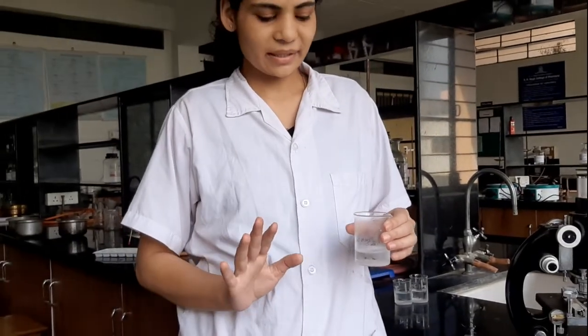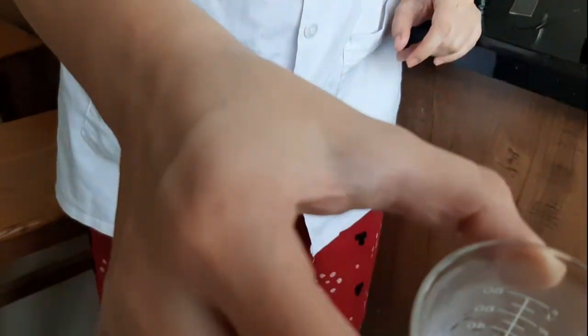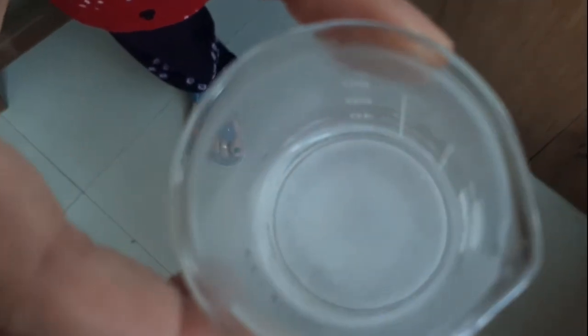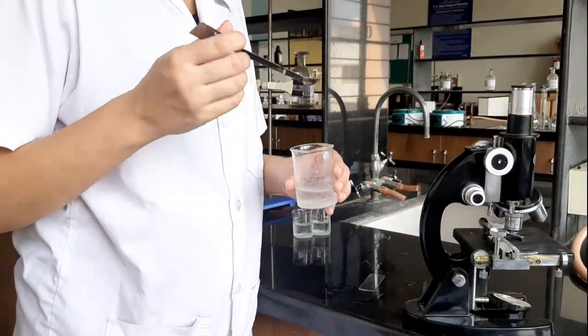Now we have completed our 60 minutes, and this is the sample for the last 60 minutes. Just look at the crystals. The growth is very nice. Now we will take out some sample, put it on our slide and determine the size.